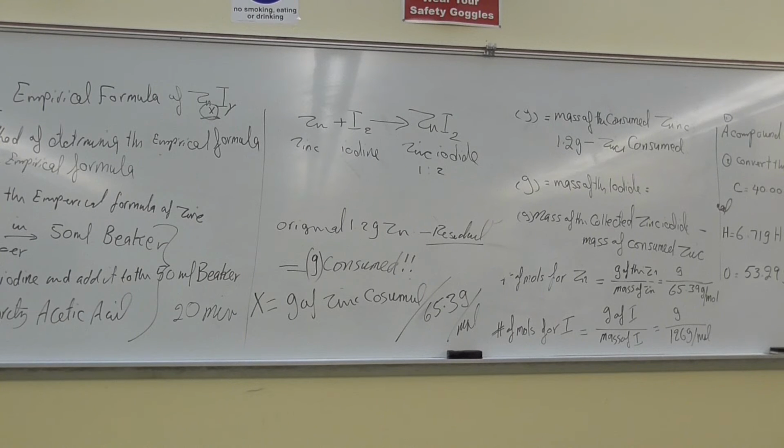By the way, iodine is going to be reacting with aluminum. Be careful. It's also irritating. Don't try it. But what I would recommend, bring your beaker with you and bring it over here. The minute you weigh these chemicals, put them in the beaker. Because the iodine is going to react with the aluminum, and the weighing dishes are aluminum. Okay?